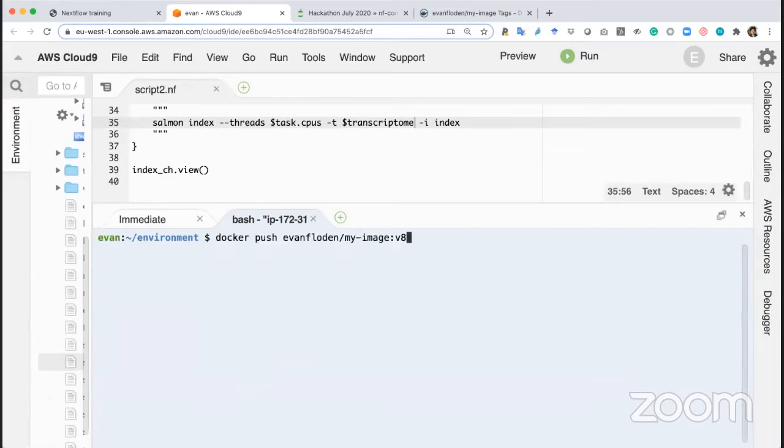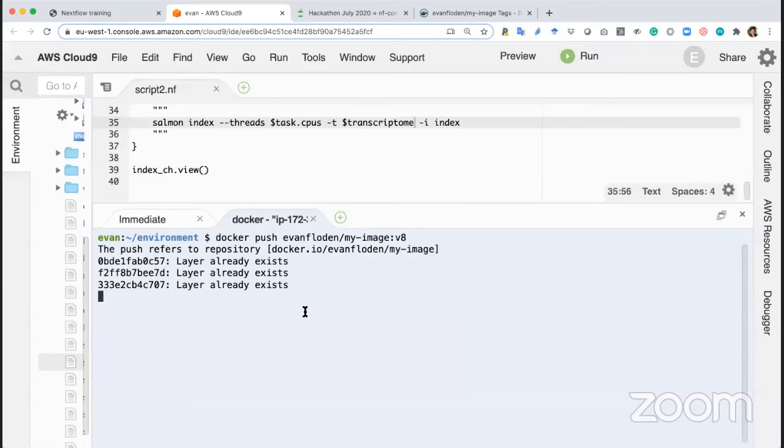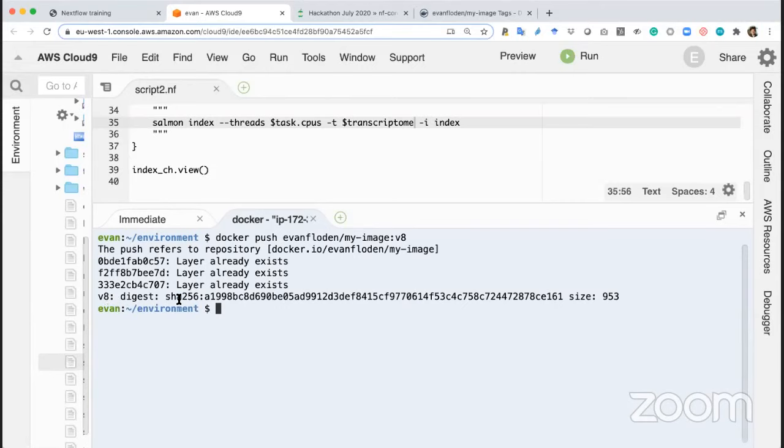One thing you might notice is that when we do this, we get this hash. So this hash on this tag, you can see it. This is a specific hash of the contents of the container. Unfortunately, or fortunately, these tags are not immutable, so I can actually rewrite over an image with a tag. However, the hash here is unique.